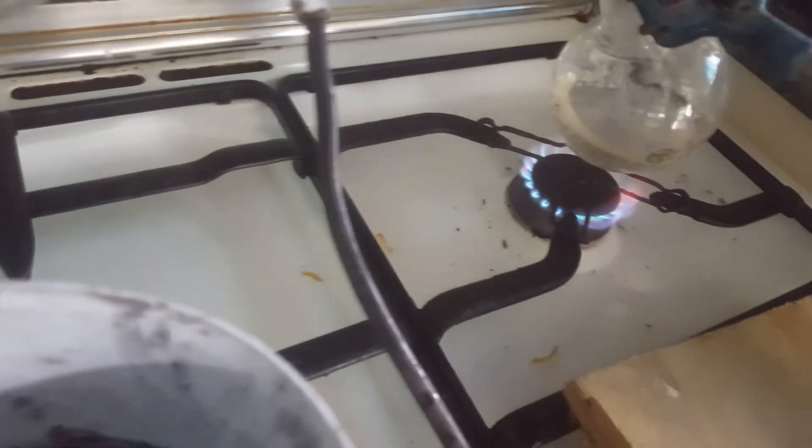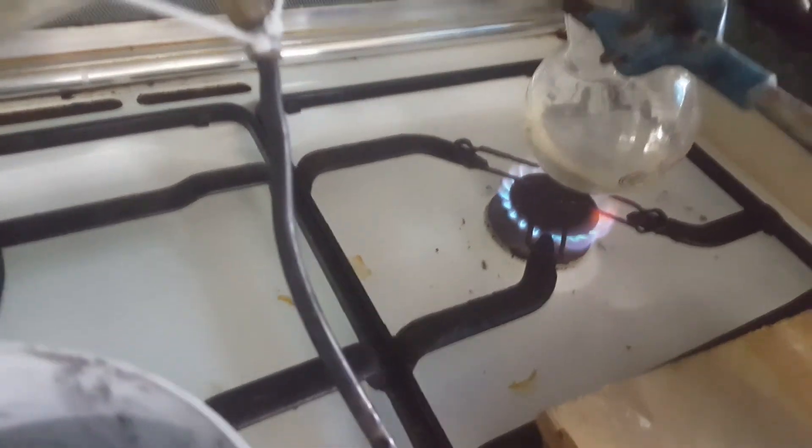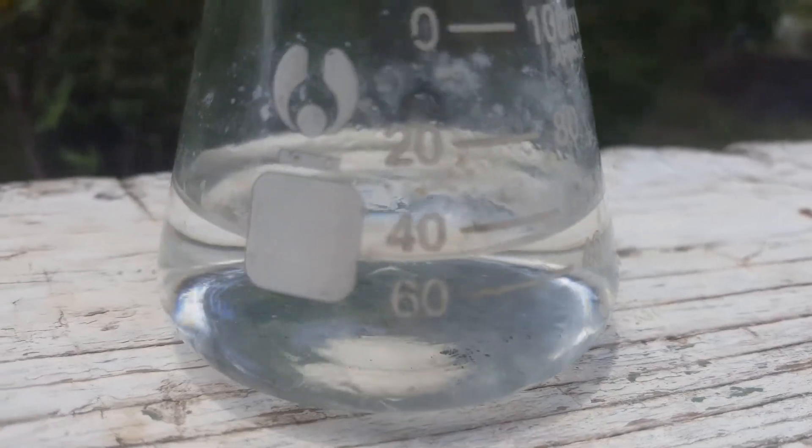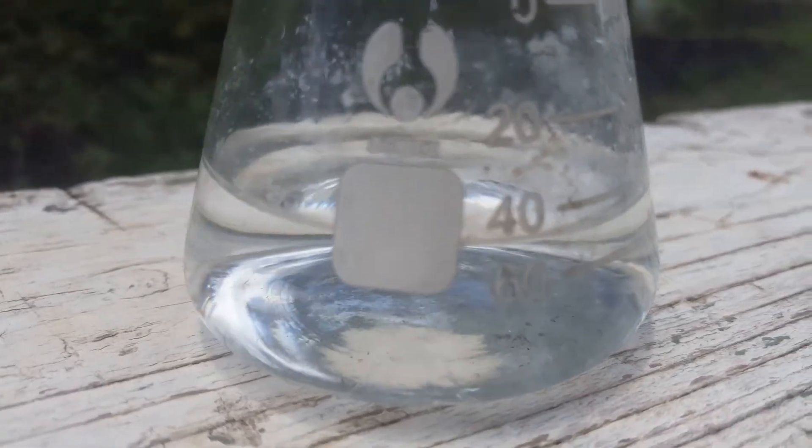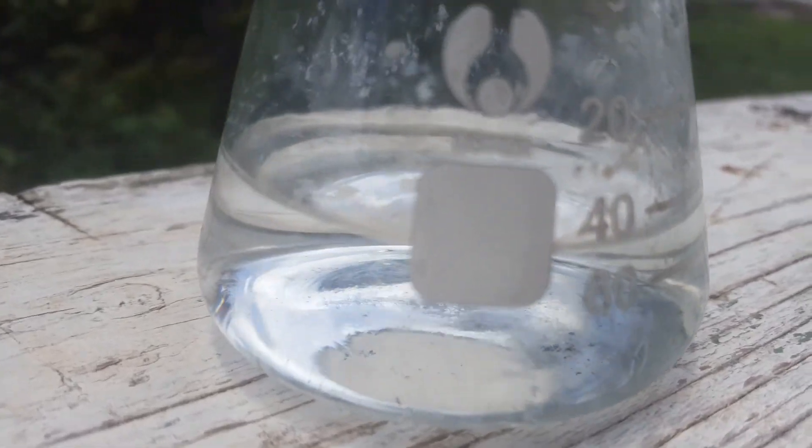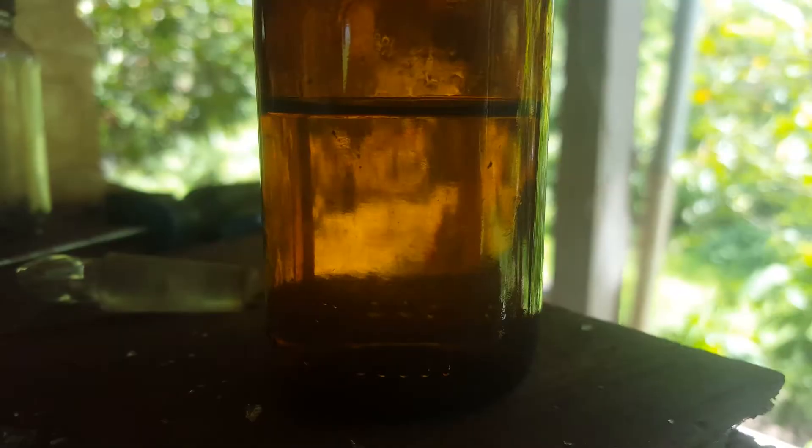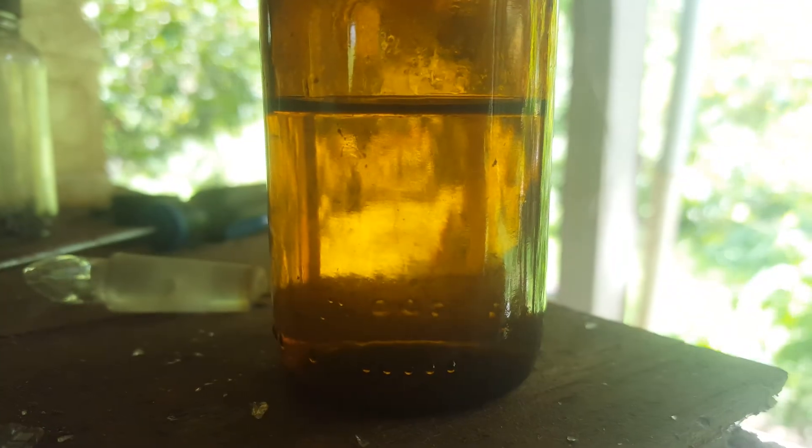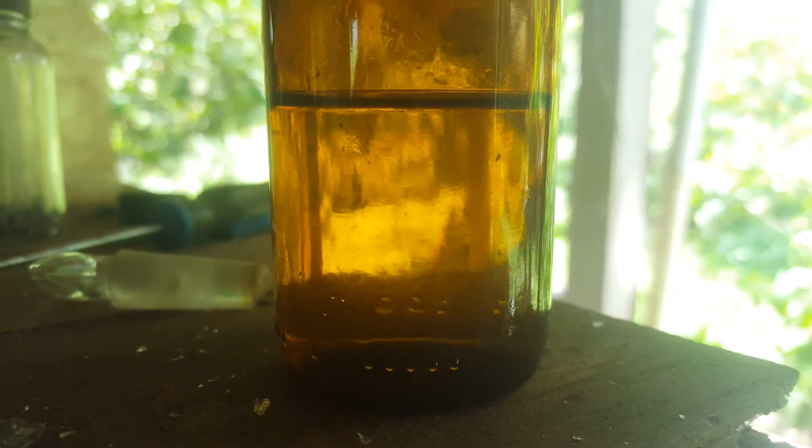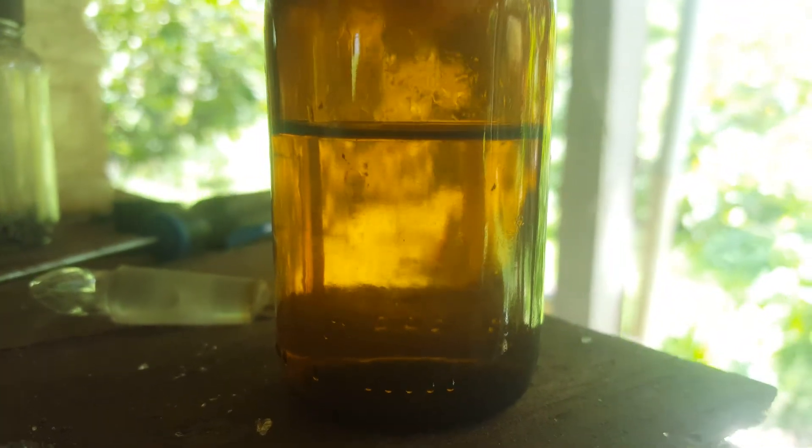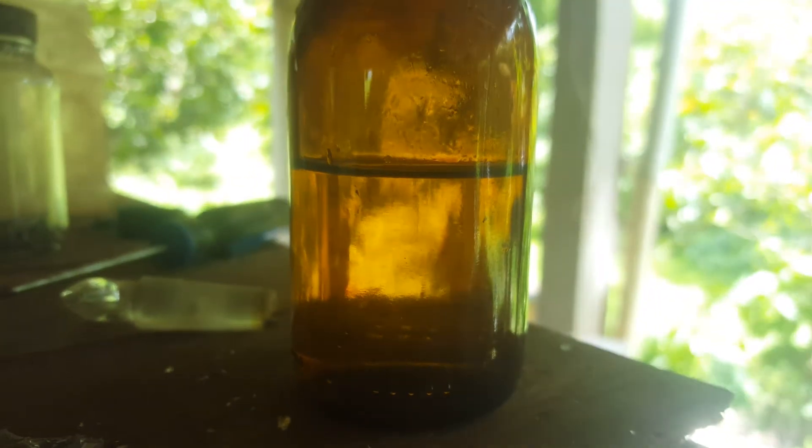I redistilled this with some of the solution in the previous distillation to obtain more hydrobromic acid. This hydrobromic acid was found to be 0.09 molar with a titration. As you can see, the yield is very poor.